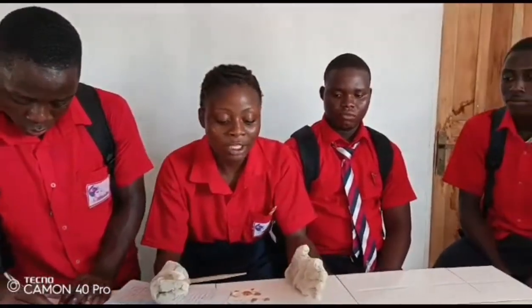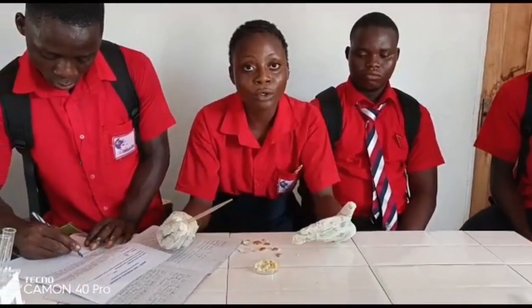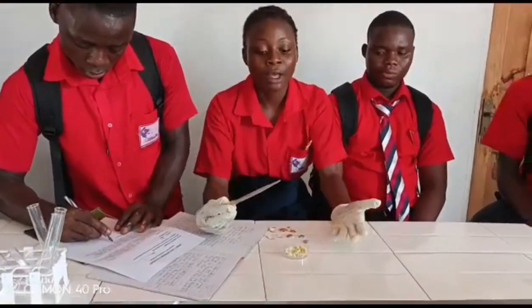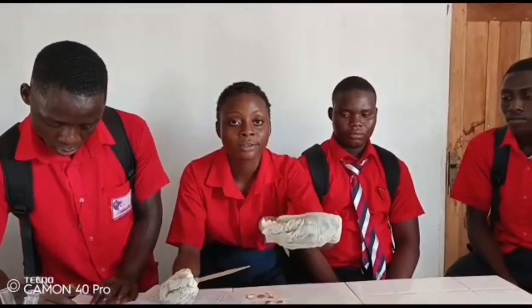We did that, and after a few seconds we observed that egg doesn't contain starch, because the iodine didn't change the egg's color, so it means that egg doesn't have starch. That's what I observed for today's lab class. Thank you.